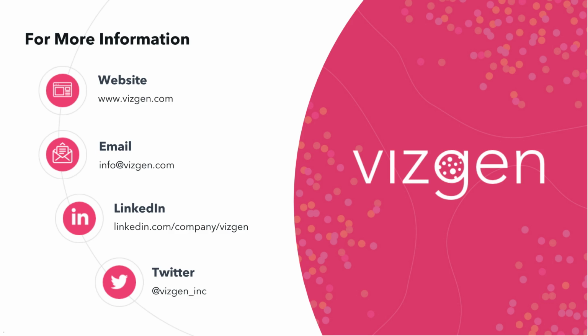Next question. Where can we download the data sets? So if you go to our website, there will be a data release program. So far, there are two data sets available. One is the mouse brain receptor data set, and the second one is the mouse liver data set. We will be posting our FFPE data sets, which cover quite a few different cancer types using a gene panel of 500 genes. It's basically our immuno-oncology panel where you will see a lot of immune cell markers, cancer cell markers, and checkpoint inhibitors and their receptors and cytokines and such.